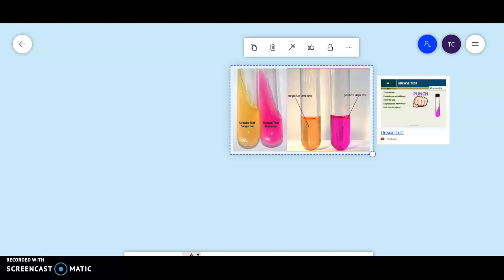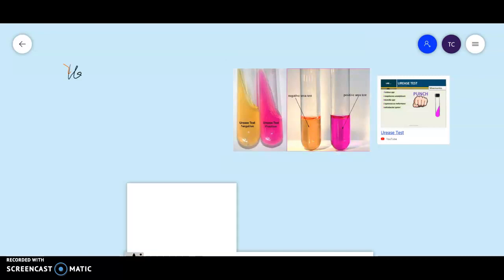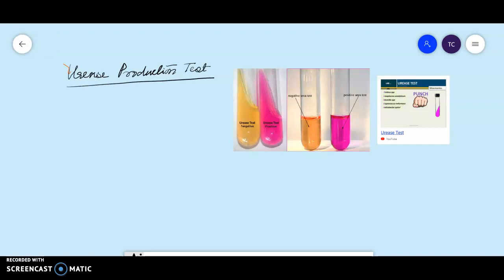Today, in my virtual lab, we will be discussing a new biochemical test, and that is your urease production test. So today in my virtual lab, I will be discussing your urease production test.